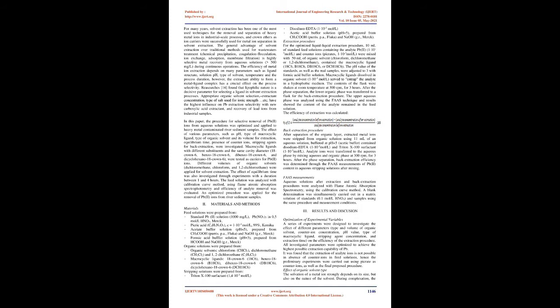Organic solutions were prepared from organic solvents, chloroform, CHCl3, dichloromethane, CH2Cl2, and 1,2-dichloroethane, C2H4Cl2. Macrocyclic ligands were 18-crown-6, 18C6, benzo-18-crown-6, B18C6, dibenzo-18-crown-6, DB18C6, and dicyclohexano-18-crown-6, DCH18C6.